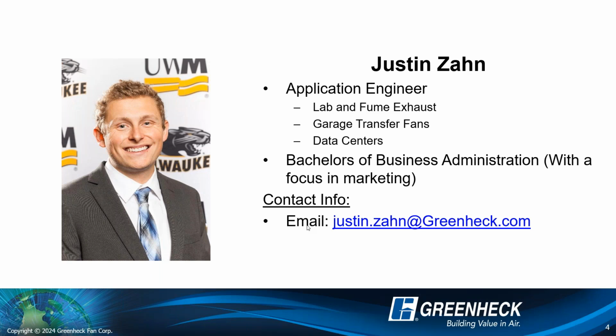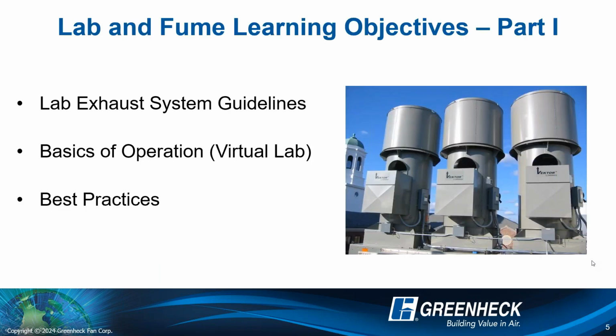But we'll kick it off here. Today, we're going to talk just a little bit about basic lab exhaust system guidelines. We're going to go over the basics of operation. We're going to actually switch to our virtual lab here shortly, which is a nice break, I guess you could say, from the PowerPoint, and then we're going to go over best practices.